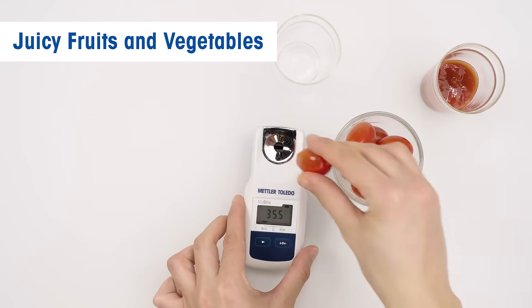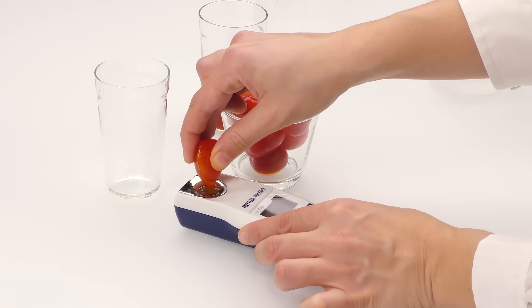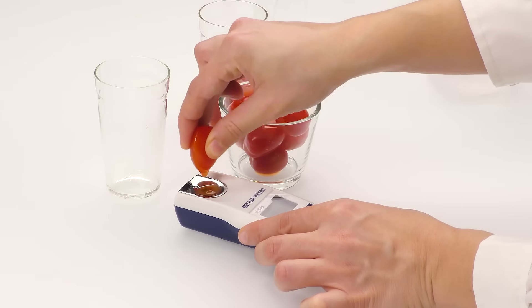Tomatoes, as well as fruit like blueberries, oranges, or grapes, can be measured directly by squeezing the juice on the prism.